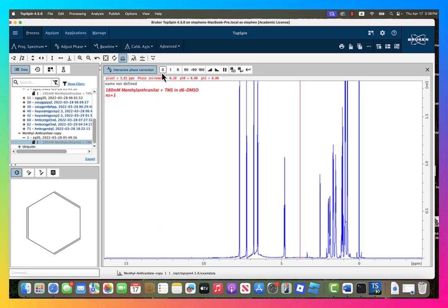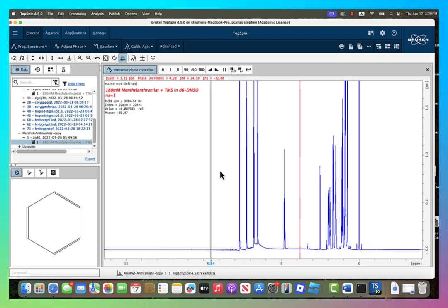And then you go up here to 0 and 1, and you right click and drag on the 0. And then it's okay, I did that one. Then you right click and drag on the 1. And you kind of do it until you get the best you can. And over here, there's this baseline button. I'm going to click it. That was this one right here. And let's do the 0 again. Let me see which one looks best.